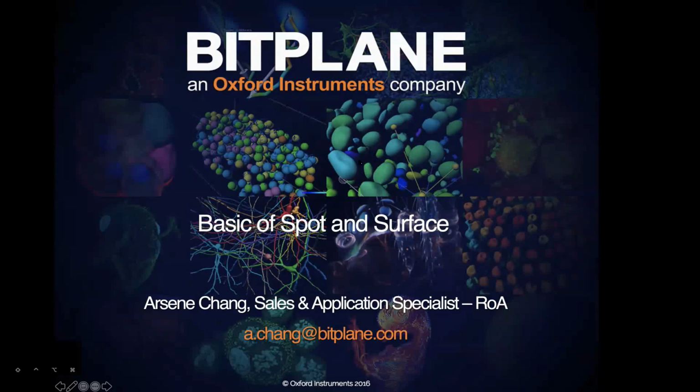So today, this week's topic is about spot and the surface. I would say it's like the basic, the fundamental of the spot and the surface. We are not going into the advanced part.